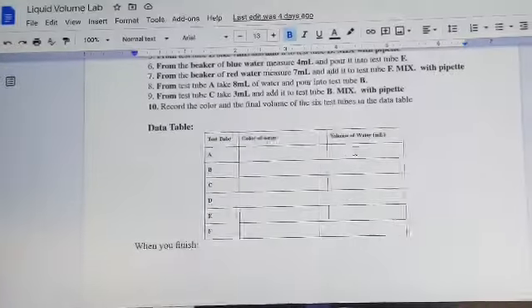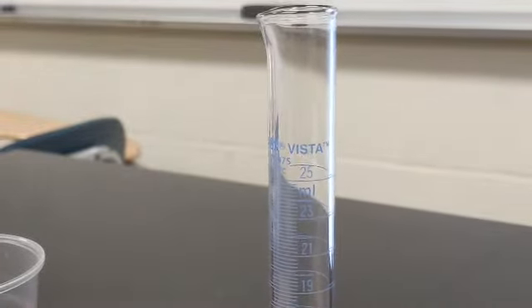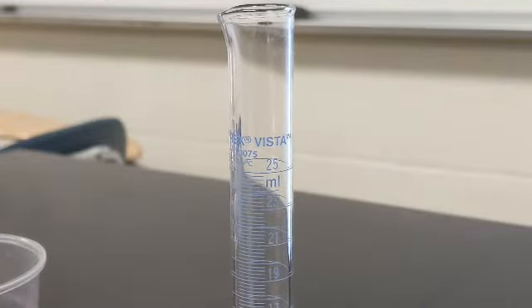Okay? And the way we're going to do that is, again, we're going to use our friend, the graduated cylinder. We're going to take the test tubes with colored water, pour it into the graduated cylinder, and then record the final volume when we're all done. Okay?